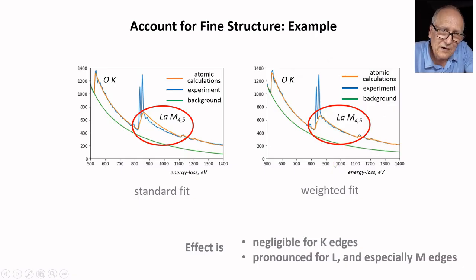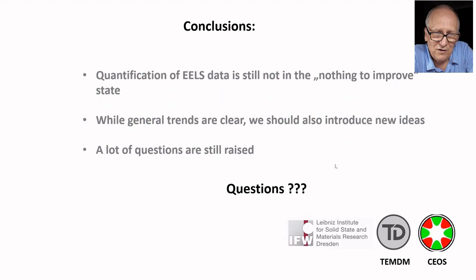Okay, I think that was all that I wanted to share with you, and now we come to conclusions. First of all, I think that despite 50 years of work on EELS quantification, the situation is still not in a state of nothing to improve.